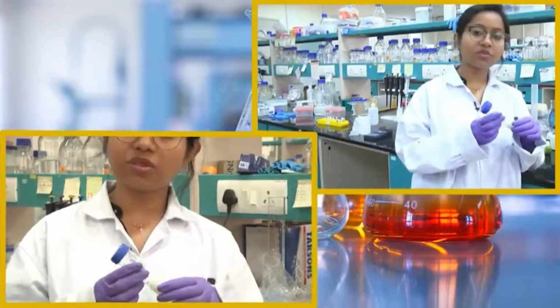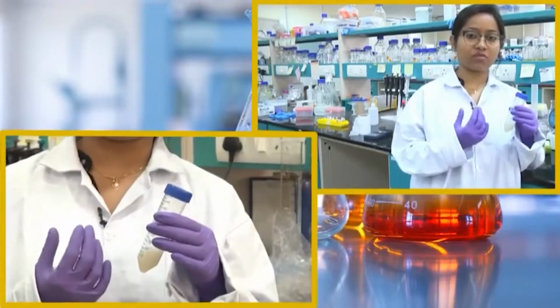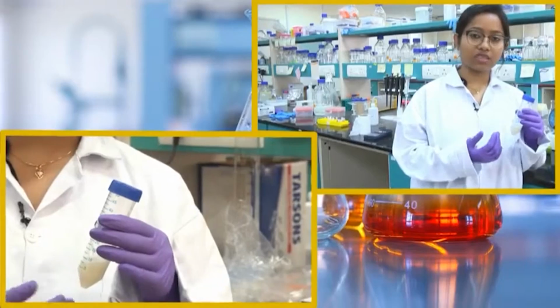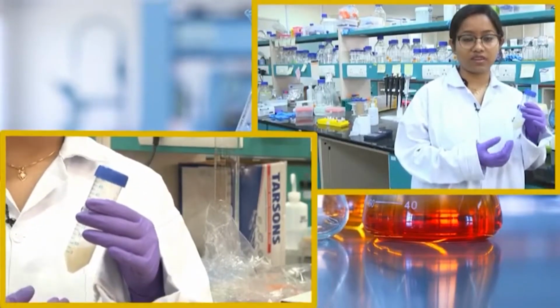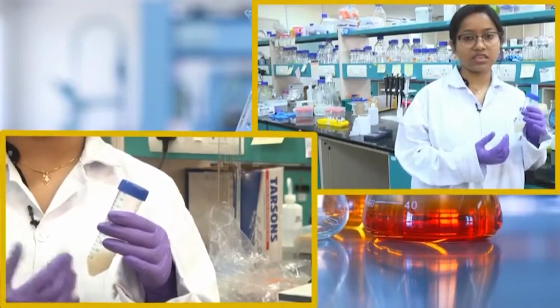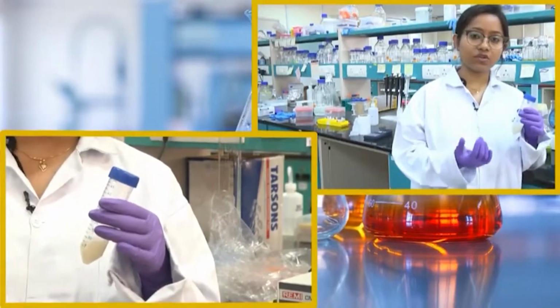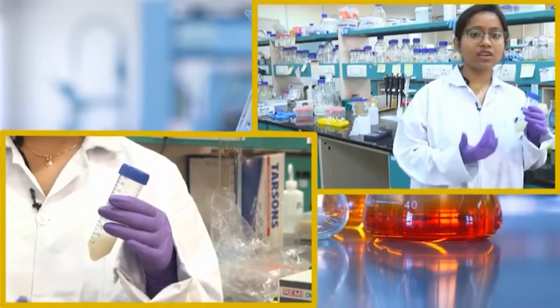Sometimes we also use sodium azide for longer storage. When you are keeping the pellet or the cell suspension at -20 or -80 for a longer period, there is a chance of fungal contamination, because the cells, the media and the proteins are quite a good growth medium for fungus. So, then you need to add something which inhibits the growth of fungus, and sodium azide is a fungal growth inhibitor. It is a toxic substance, and it will inhibit such growth, and later when you start isolating or purifying your protein, it will not hamper anymore.